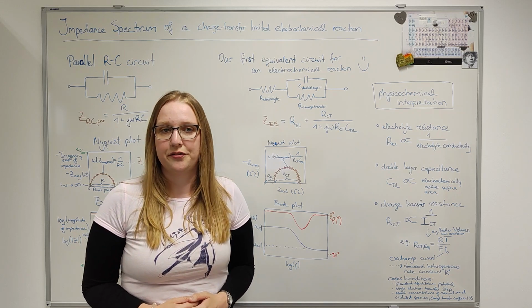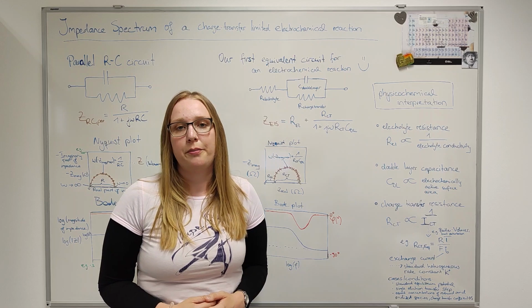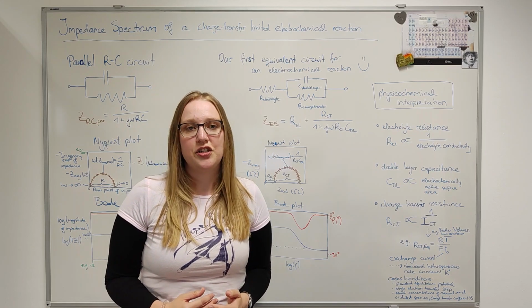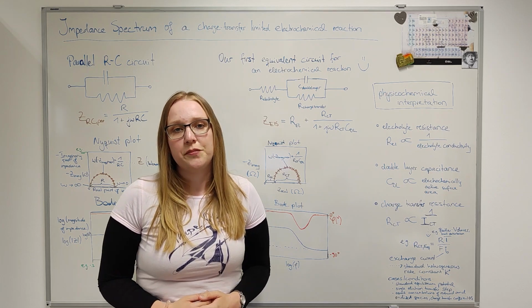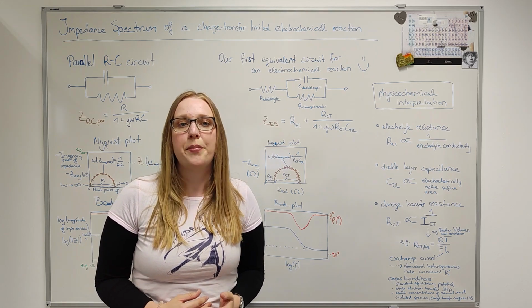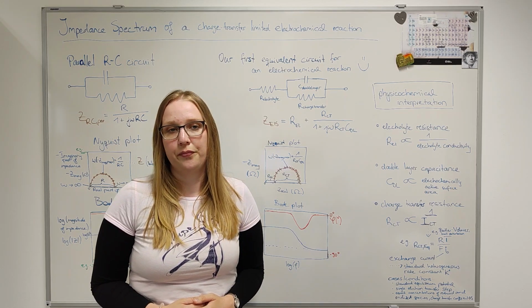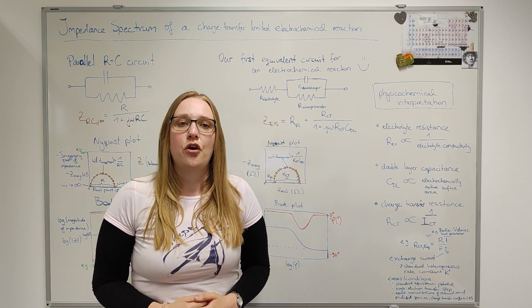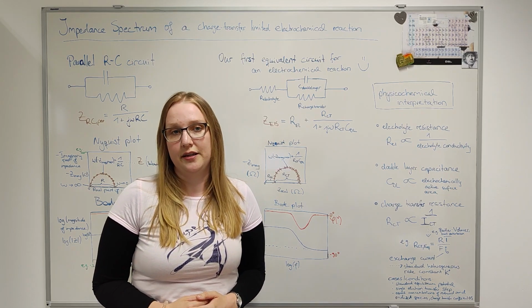We can also use impedance spectroscopy to obtain important properties of chemical systems, such as heterogeneous rate constants. For this, we derive relationships for potential and current based on electrochemical models and theories and compare them to mathematical descriptions of our electrical analogy. For example, how much current flows at a given electrode potential can be described by Butler-Volmer kinetics.